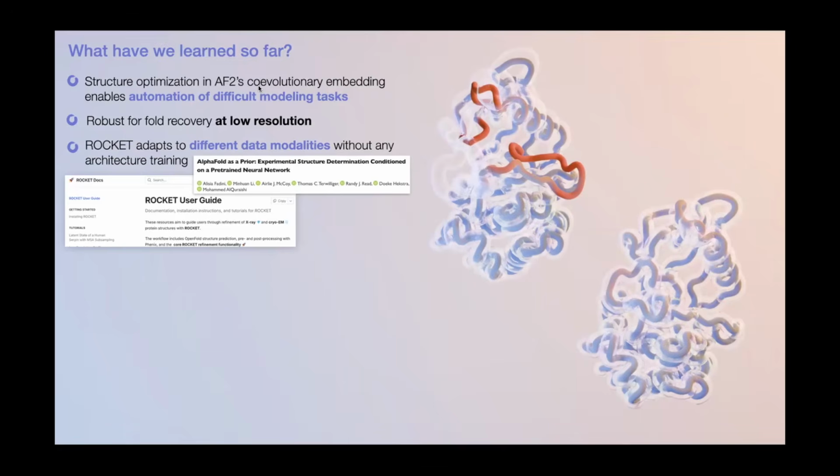The key thing here is that we've implemented it right now with crystallography and cryo-EM. In principle, if you can formulate a log likelihood target for your data, then this is adaptable to any other data type. And Min-Hwan will slowly introduce our GitHub, our documentation and our preprint.